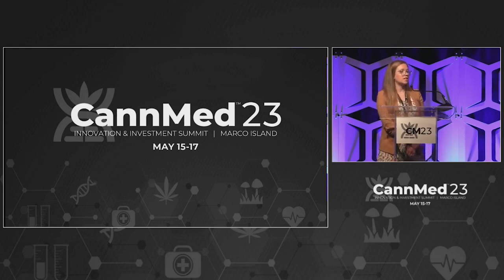So with the microbes, the thing is that's just allowing us to culture them and to grow them. But standardly, they're still there. That's just allowing us to quantify them by adding them to that broth. But if they're that hard to culture, then it seems like they're probably less competent to infect me too, right? It's hard to say. It depends on what it is. If you have some powdery mildew, I don't think you want to be inhaling the powdery mildew. No. I don't want the toxins or the residue from it, right?